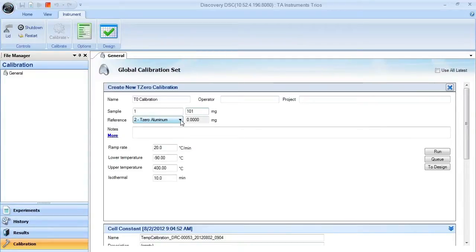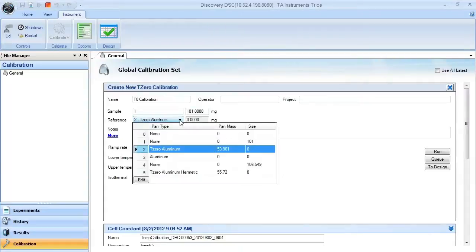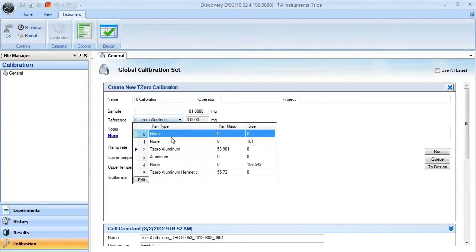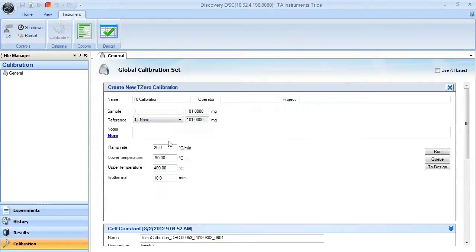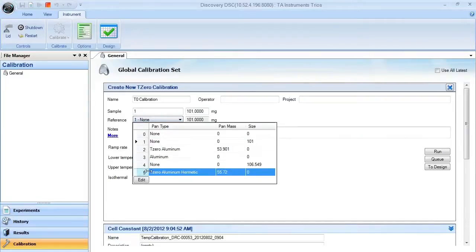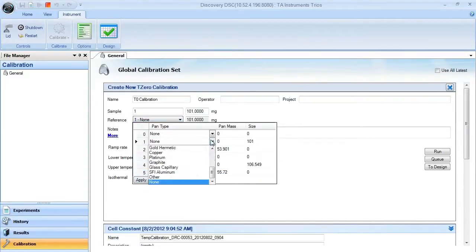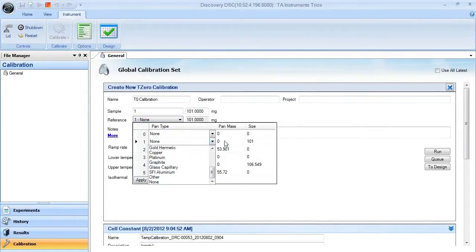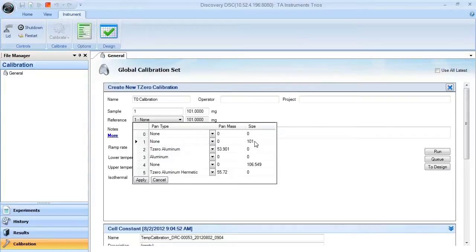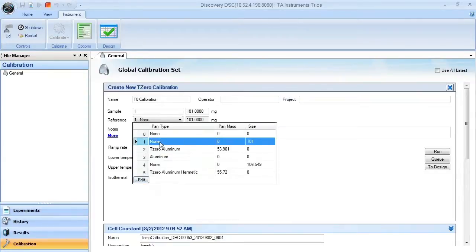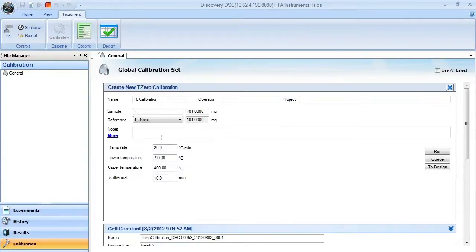When you place your red reference sapphire into the tray, make sure that you select the correct pan number. In this case, you need to make sure that you choose none as your pan type in this drop-down menu. Make sure that there is no mass listed under the pan mass, and make sure that you enter in the correct weight of the red sapphire in this size box. Once you do that, hit apply, select the pan number.